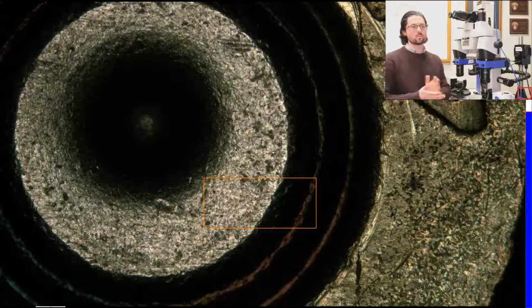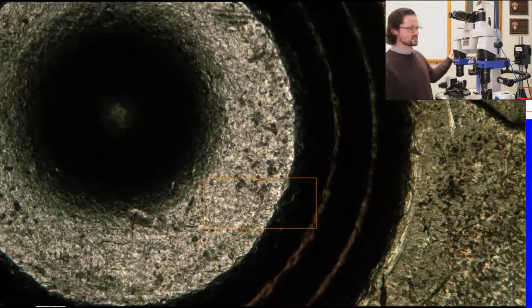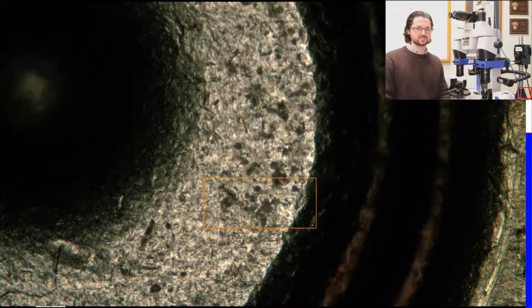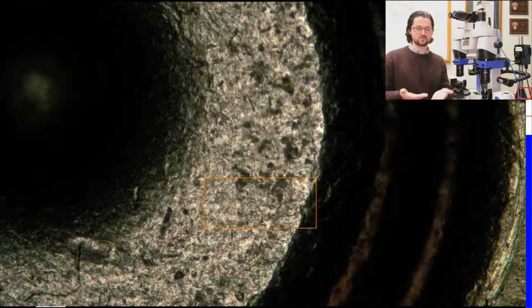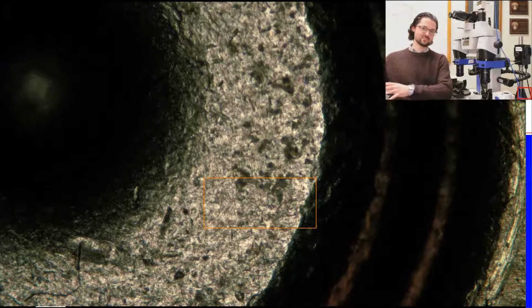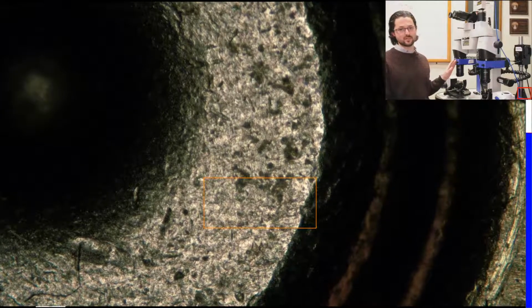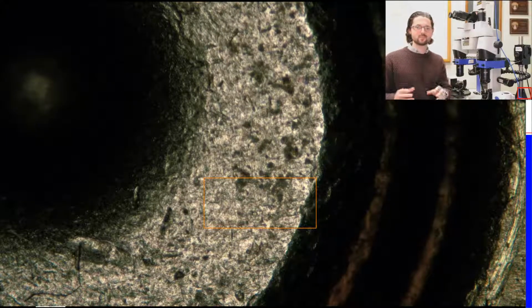So essentially, what the coaxial system does is that you get light that is bright, directly coming down through the optical system. It's basically glare-free because of those polarizers and compensators. And it's really good. It's primarily used a lot in industry for specular reflection. So think about if you were looking at a mirror surface or a circuit board or something that has a lot of direct reflection. In firearms work, this is actually a customer's piece of equipment that once it passes quality control, we'll be sending them. But what they discovered is that coaxial illumination works really well on granular breach faces.